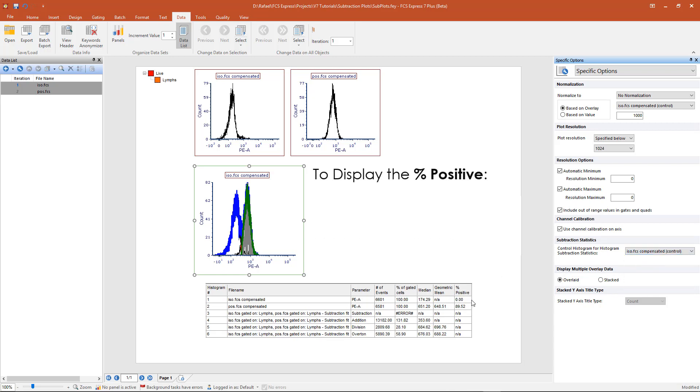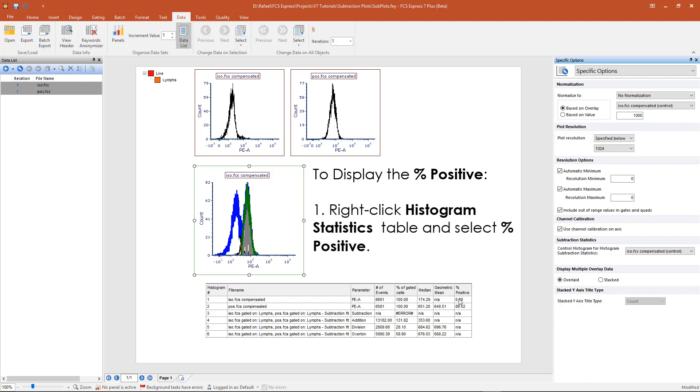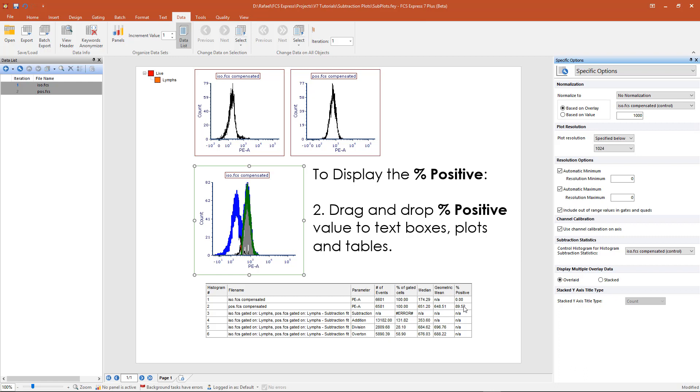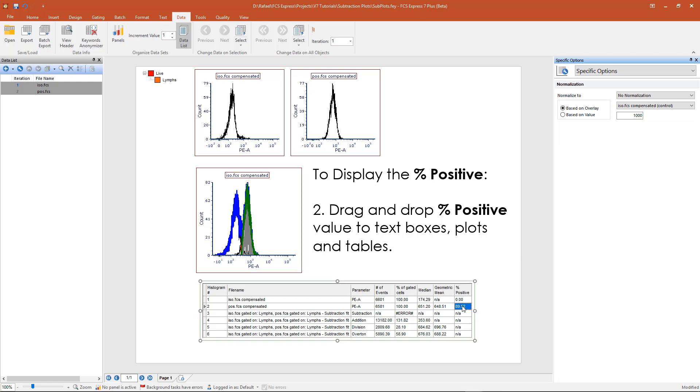The percentage positive will appear in the histogram statistics table. You can also view the percentage positive in a text box or on your plot by simply selecting the token and dragging and dropping it onto your plot.